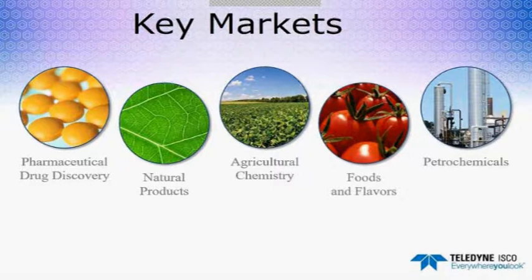Oh, here we go. Can you estimate mobile phase for alumina based on that for silica gel? The answer is no, not really. The reason for that is that the columns do have different selectivity. When I worked in natural products over at Merck, I had one example where a compound would not work with silica gel at all, but it eluted from alumina with 100% methanol. It was a cyclic peptide.